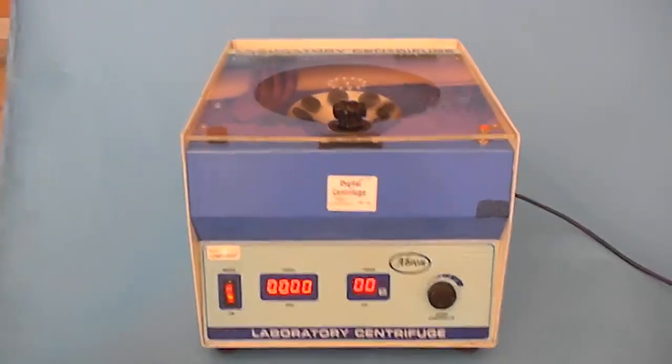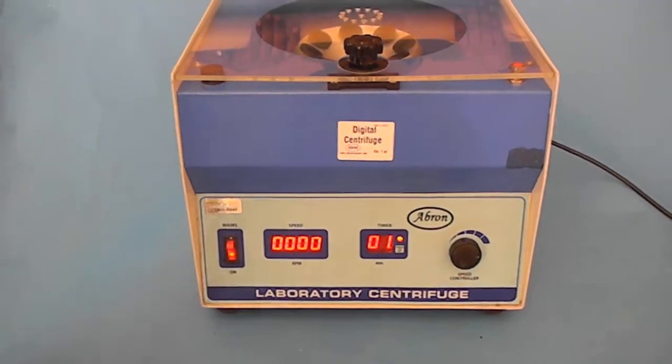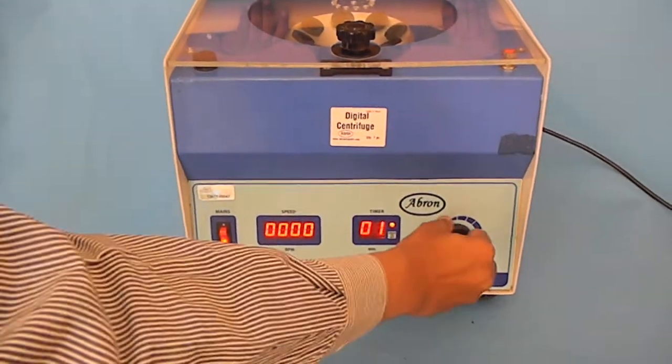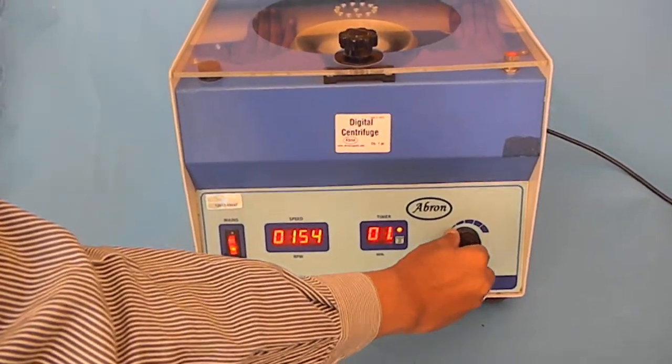There is a timer. You select the timer by one minute, then rotate the knob for speed control. Rotate it on the right side to full.